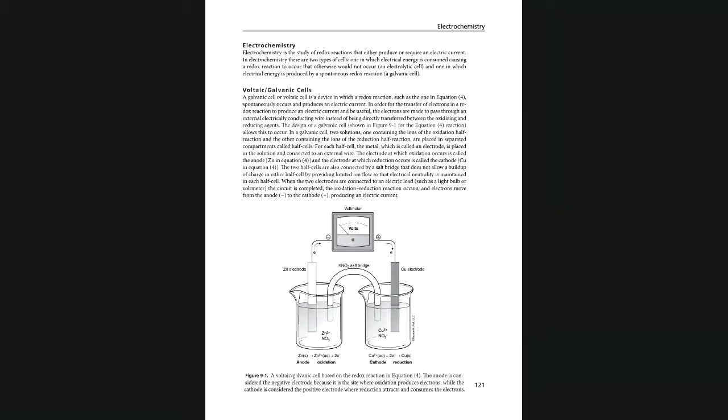And oxidation takes place in the anode, and on the anode side, electrons are being produced.